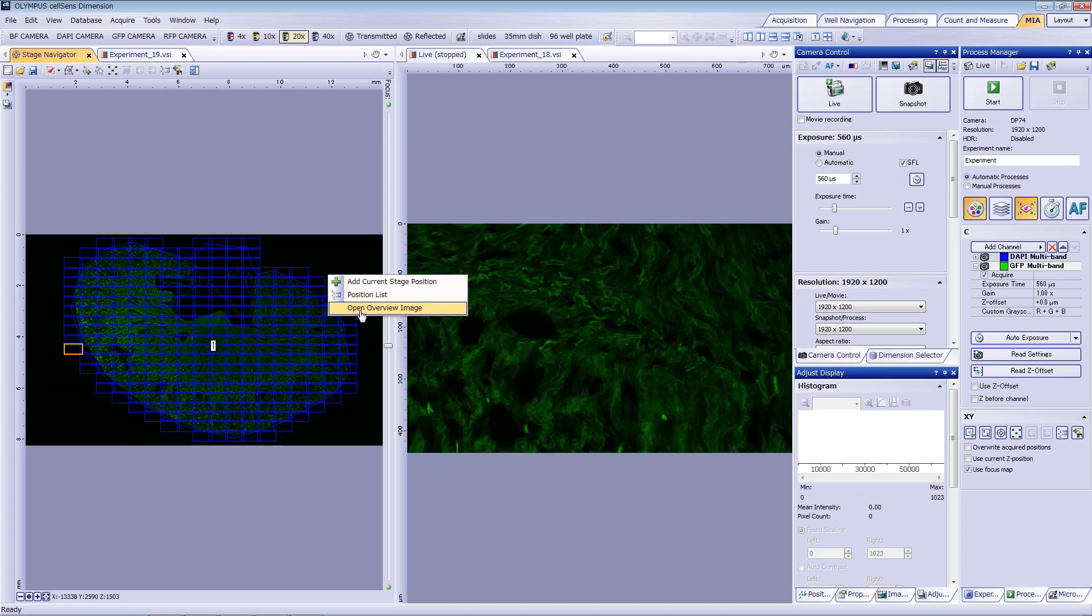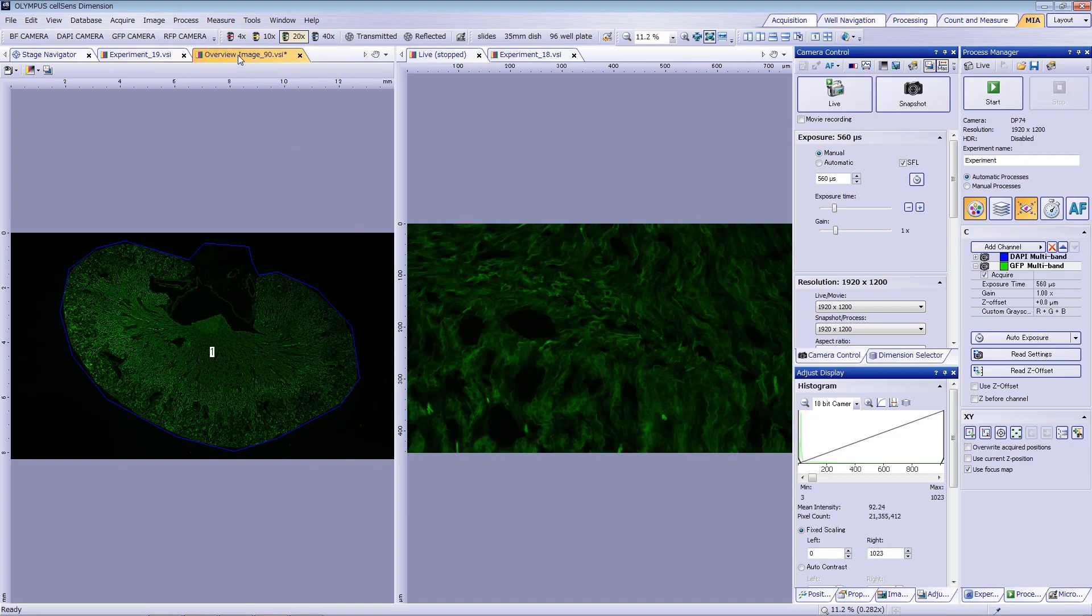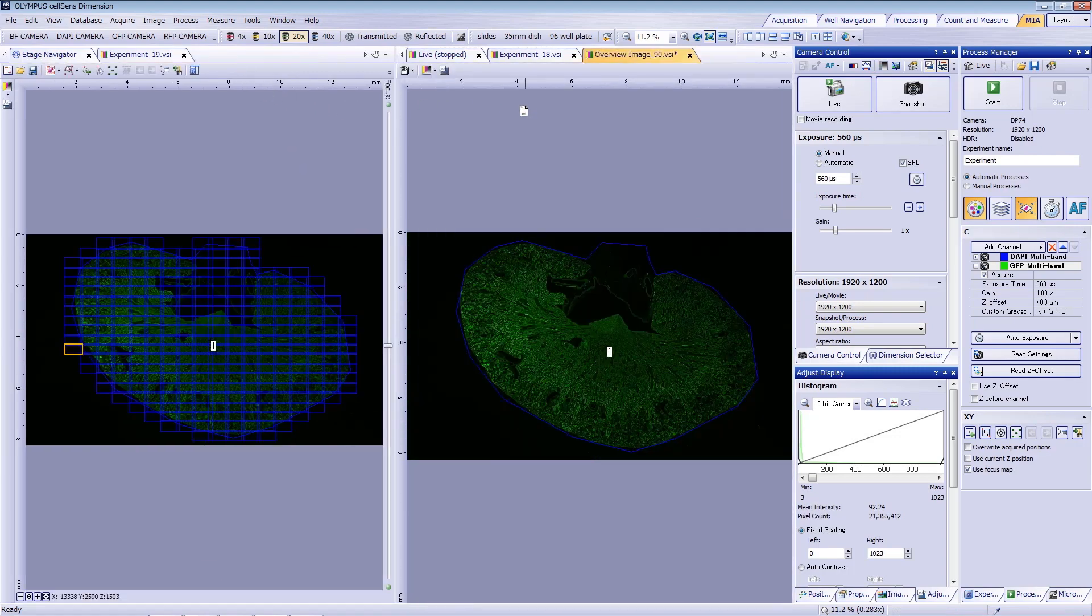To confirm that the stitched image is a higher resolution than the overview map, you can zoom into a structure of interest and see the difference in image quality.